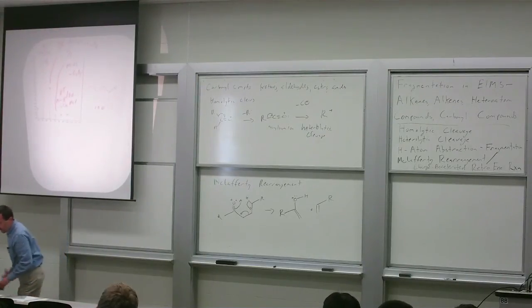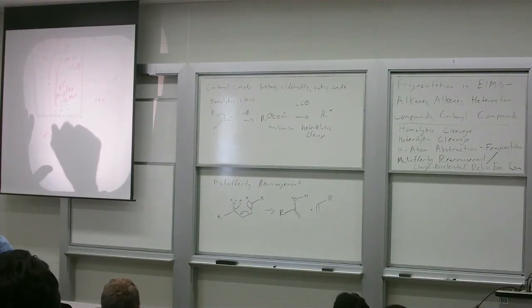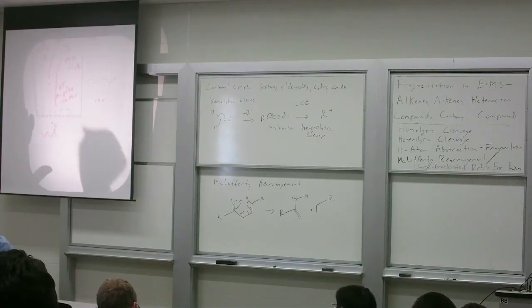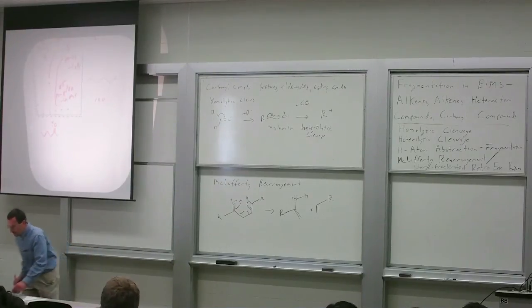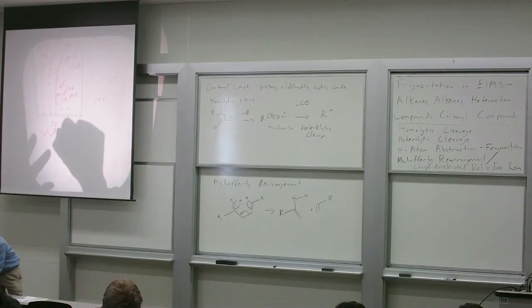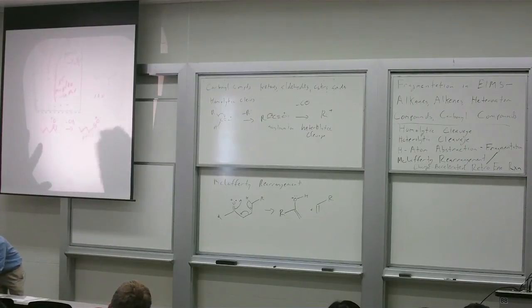Let me just show you a couple of these processes. We won't go through every one. Here's our homolytic cleavage pathway. We can lose either our butyl group or we can lose a methyl group. I will just show you one of them. This is loss of CH3 dot. Gives rise to an acylium ion. That acylium ion is at 85.